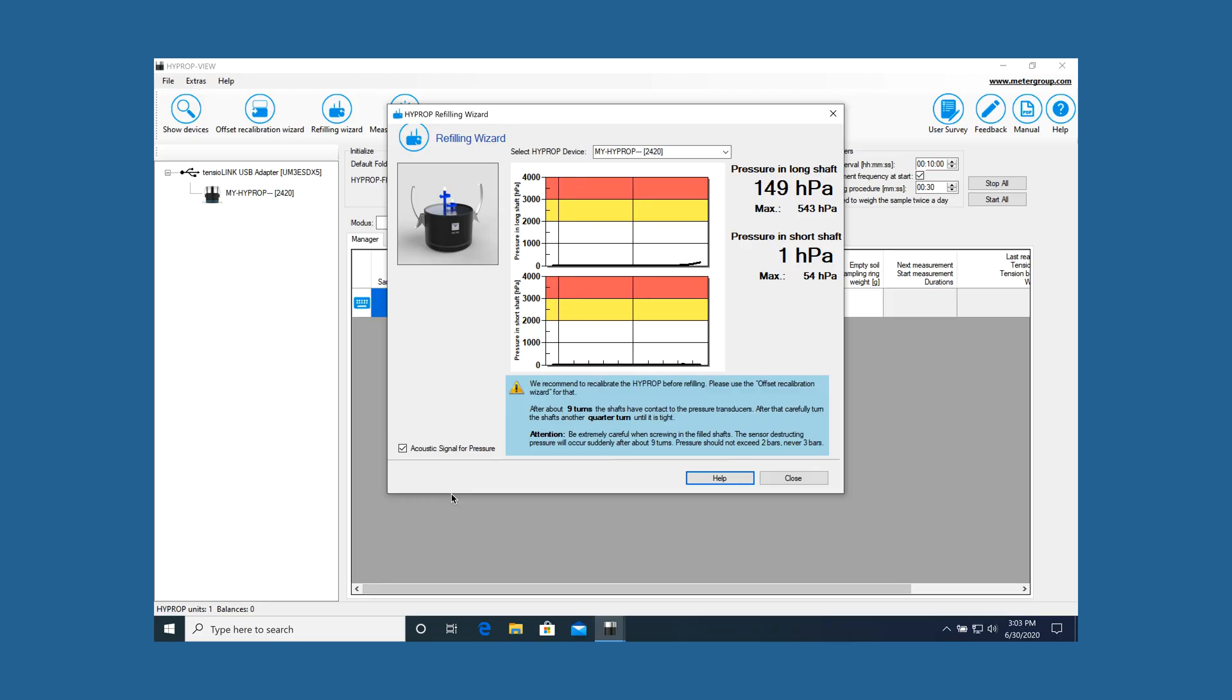Monitor the pressure display on the screen. The pressure should increase up to the atmospheric air pressure minus 1000 hectopascals or 100 kilopascals within 15 seconds.